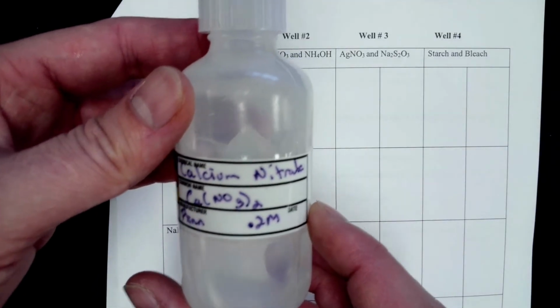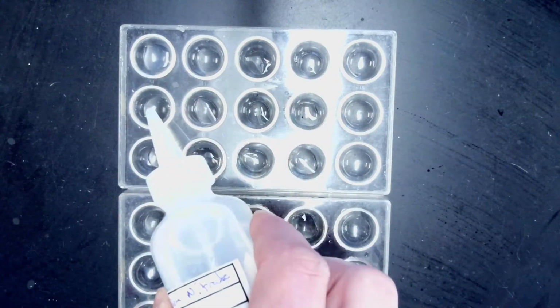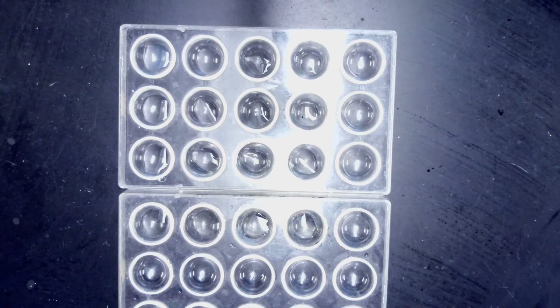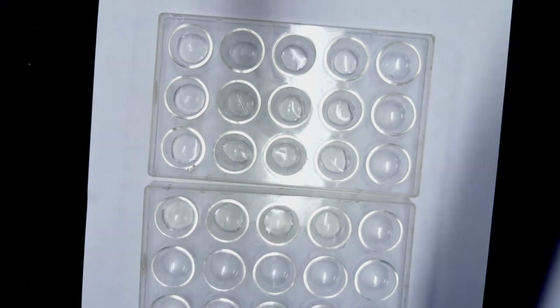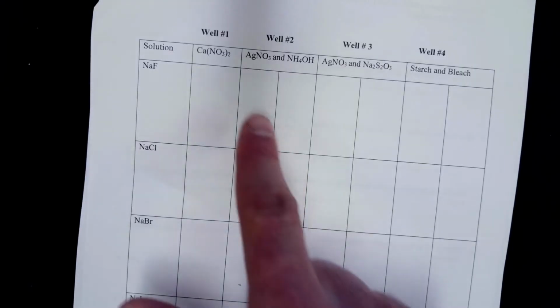So now at this point we're going to add calcium nitrate to the first column, to well 1. And you'll see for this one there's no reaction for any of them, so you can just put NR all the way down. Nothing happens on that one. I put a white paper under it so that it's a little easier to see. Next step, so there you go, write your observations there. Go back in the video if you need to take a look at that.